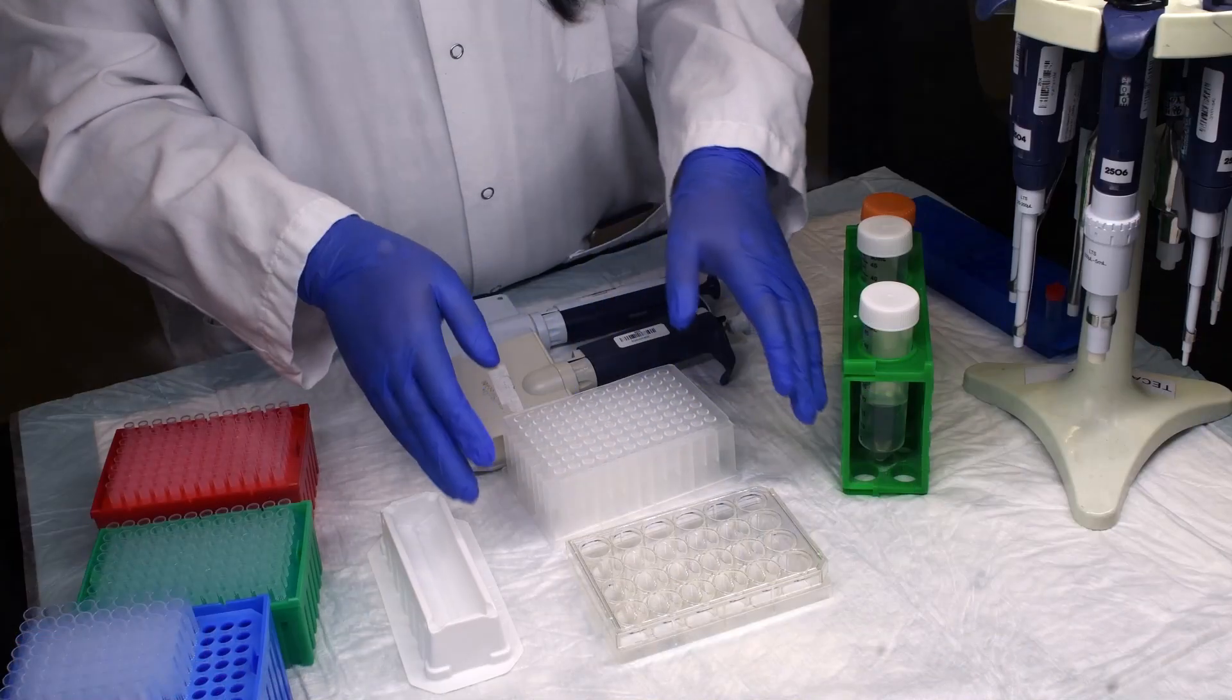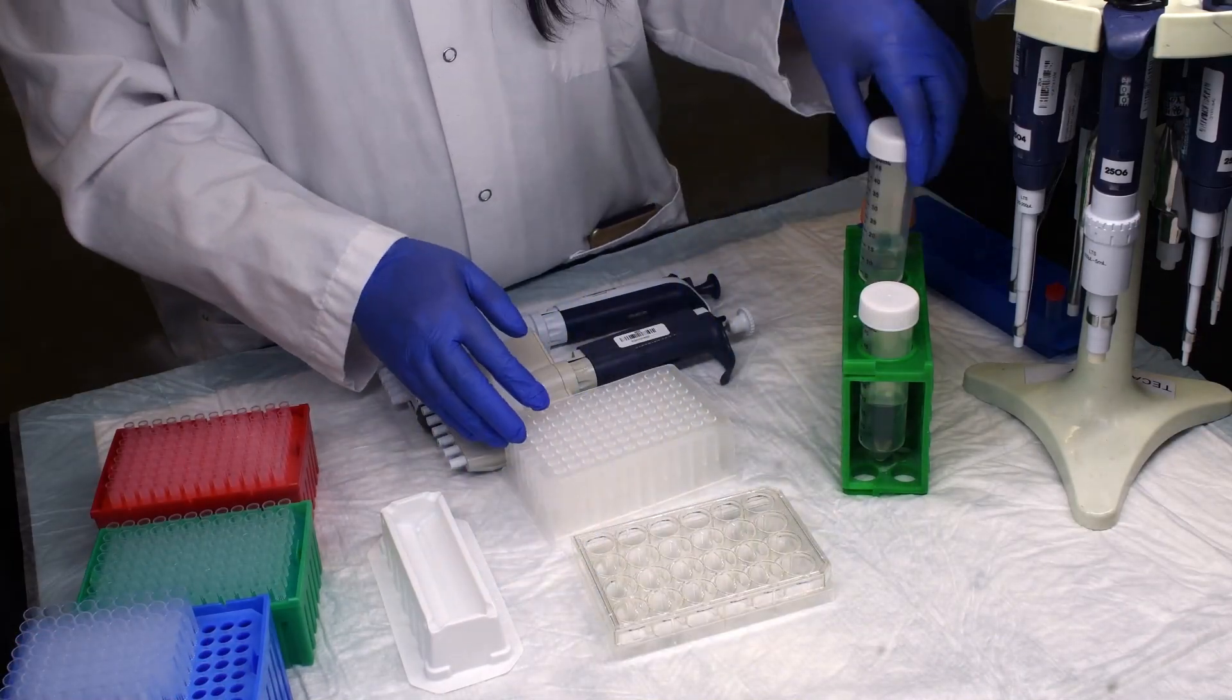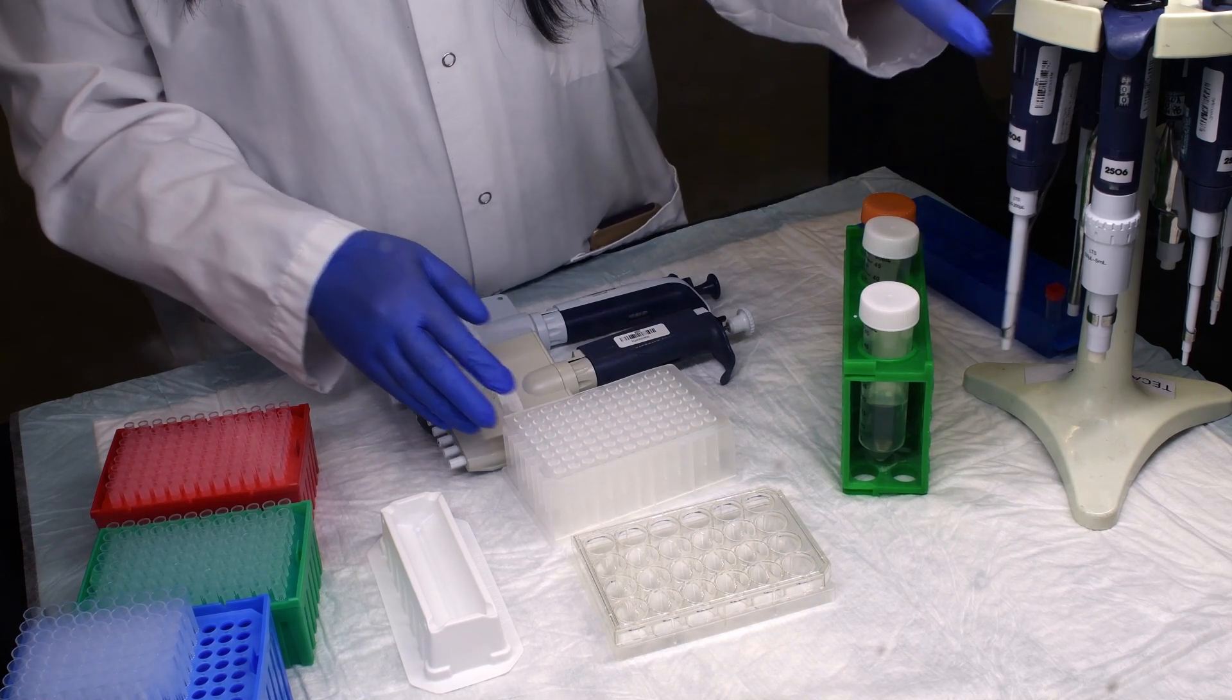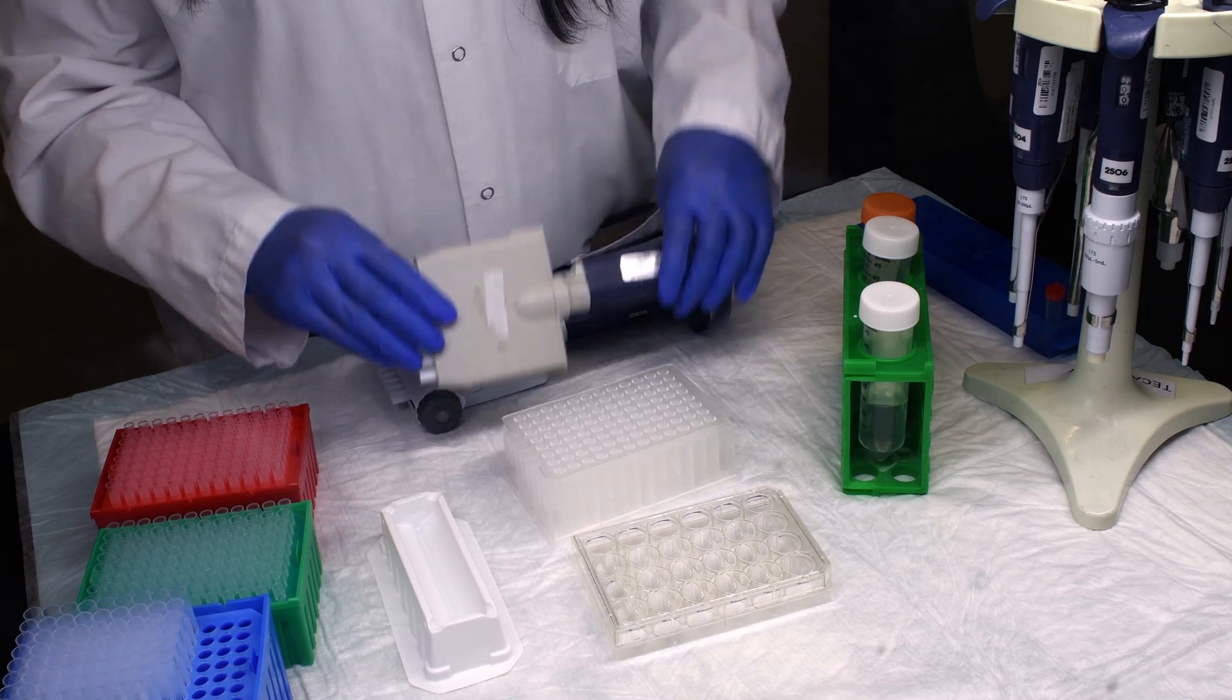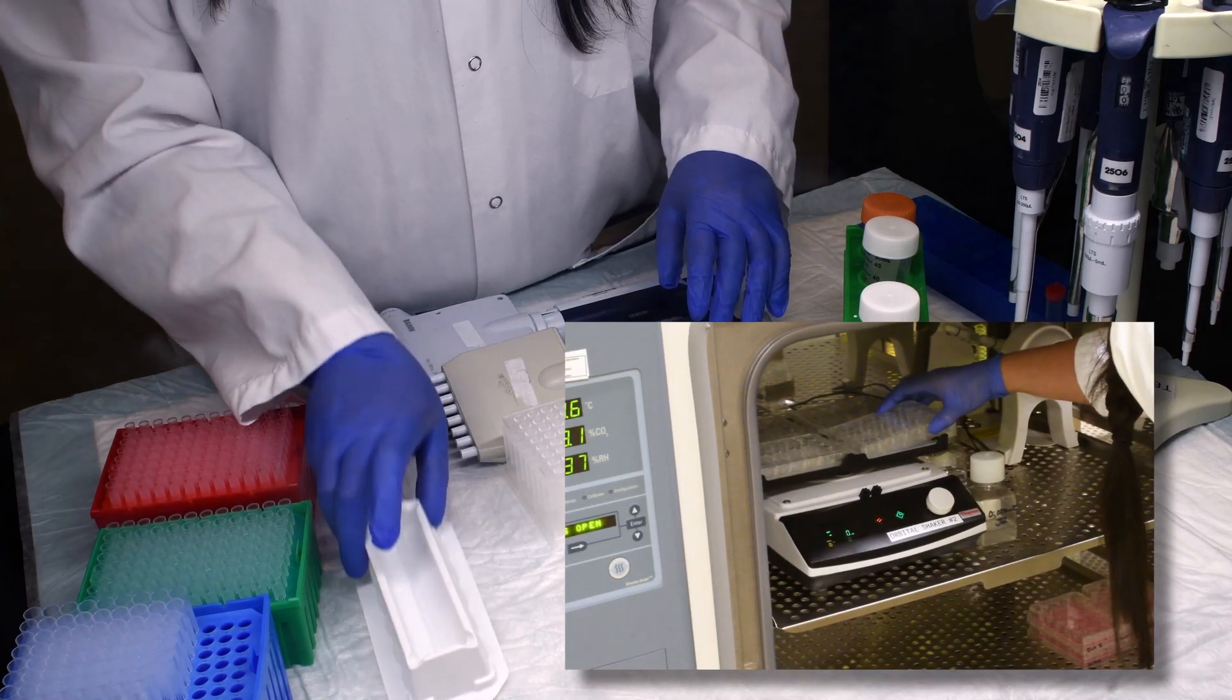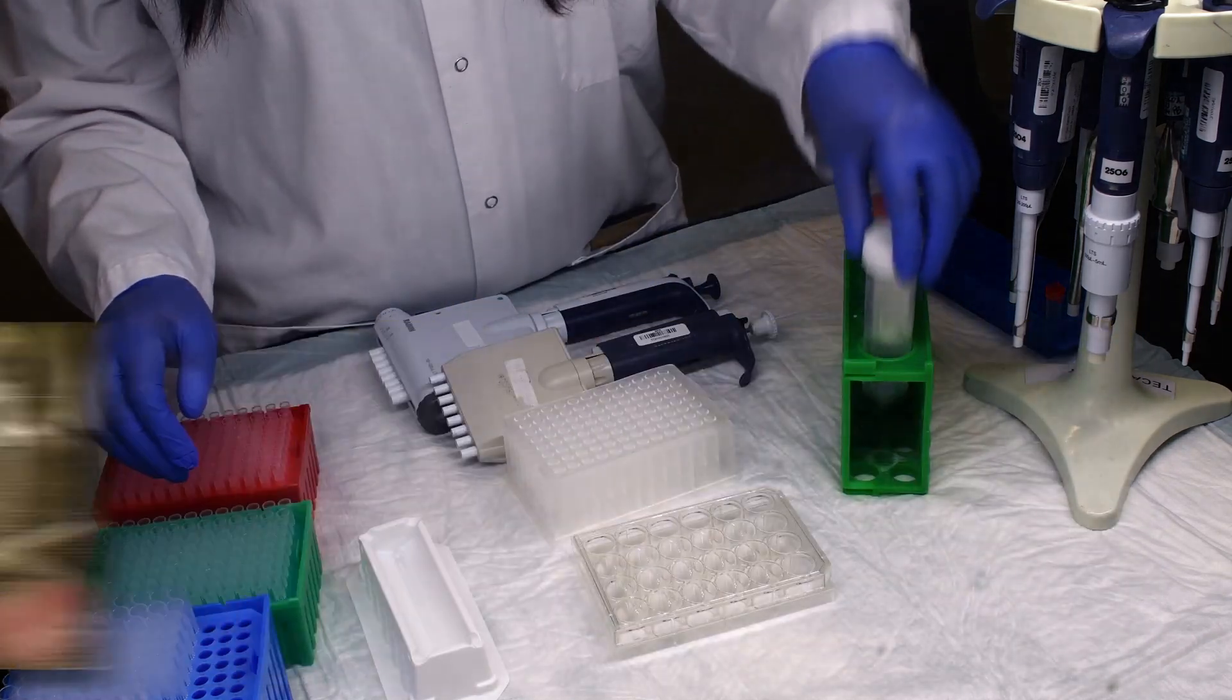For these assays, we recommend using standard 24-well tissue culture plates, incubation medium pre-warmed to 37 degrees Celsius, a micropipette set with multi-channel pipetters, tips, reagent reservoirs, tissue culture incubator set to 37 degrees Celsius, plate rockers, and a stop solution.